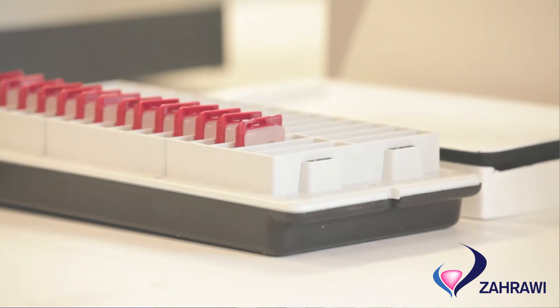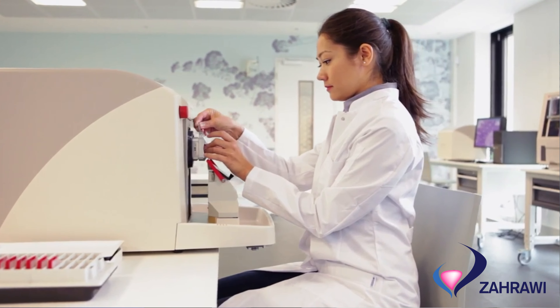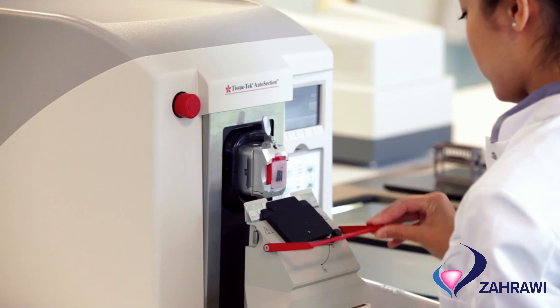The Tissue Tech Auto Section is one of those products that can help us and our partners empower these pathology professionals. When we're looking at the system itself, most people see it as a normal motorized microtome, but actually we're going one step beyond that — it's full automation that we actually seek behind it.